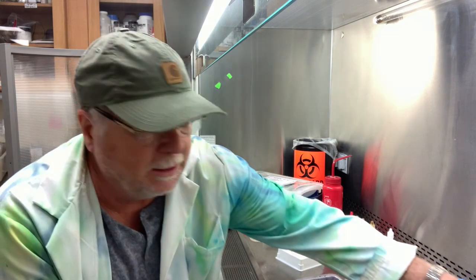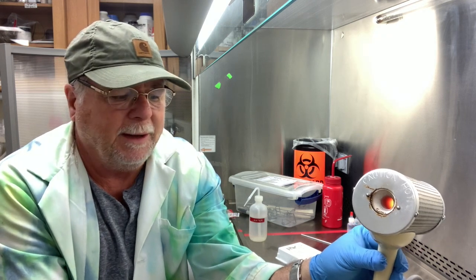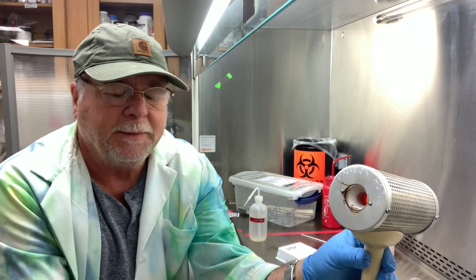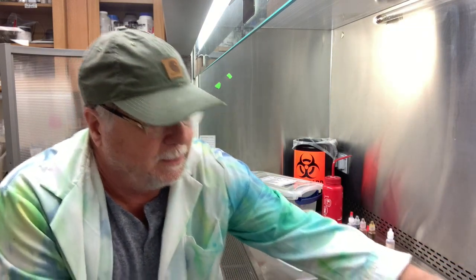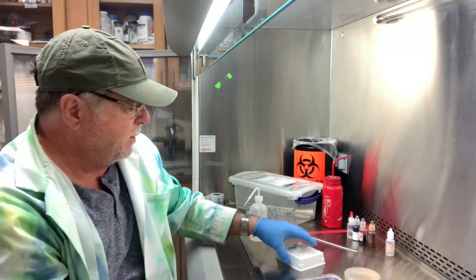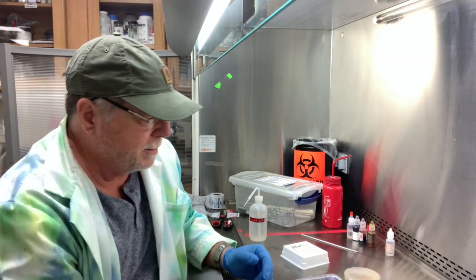Okay. So we're going to do this. We're also using a different burner. If you can see, it's red hot. This is a ceramic burner, but there's no flame, so it's a ceramic heater, I guess. We're going to take this and sterilize our loop that way, mainly because I don't want to have the hood fan going, which we would have to have in order to run a Bunsen burner or a Tyrrell burner in here.